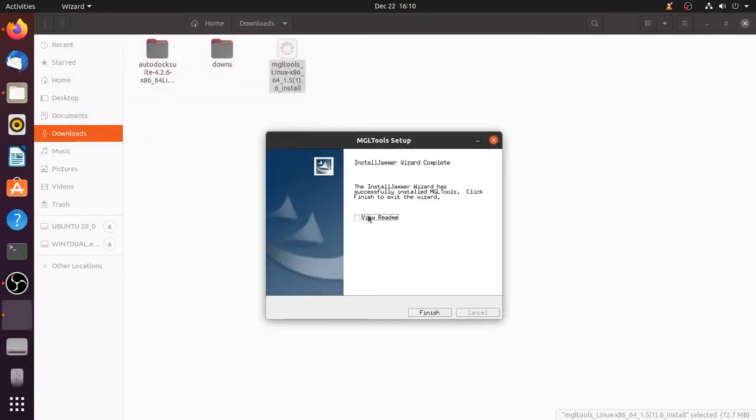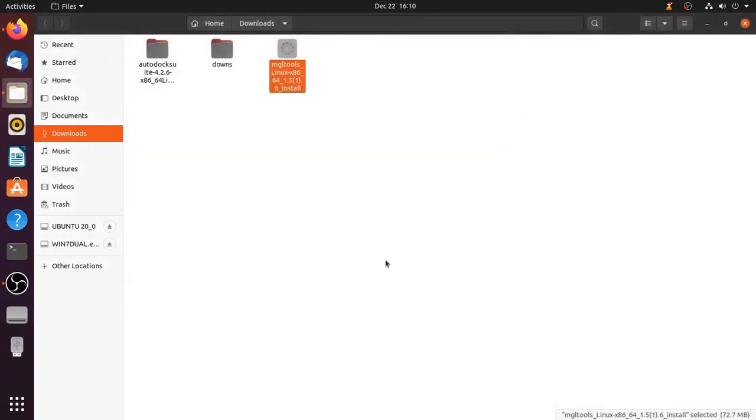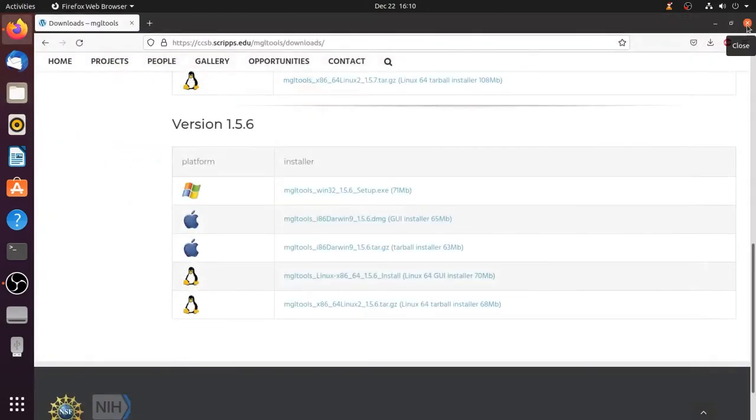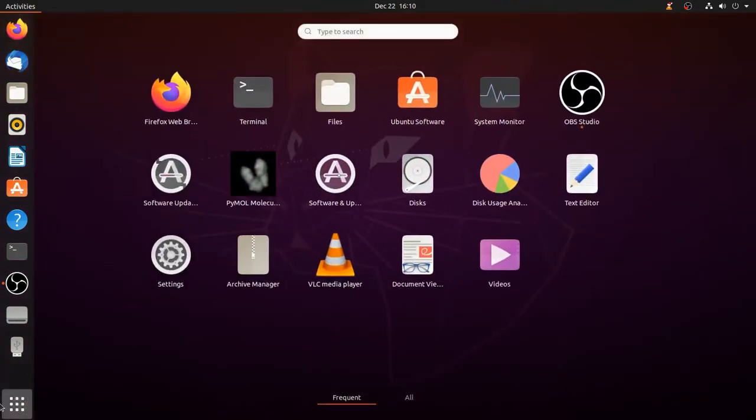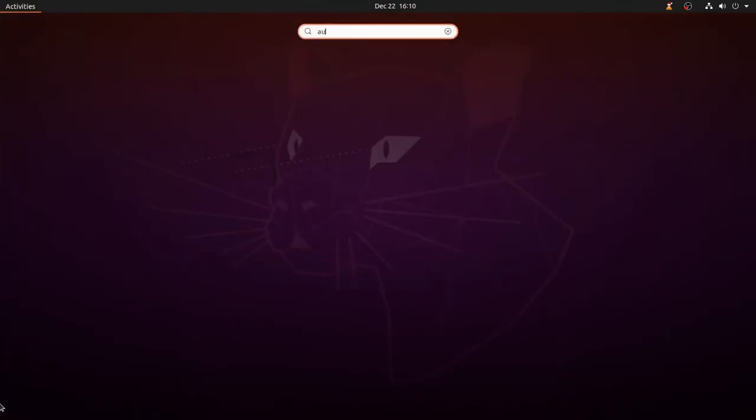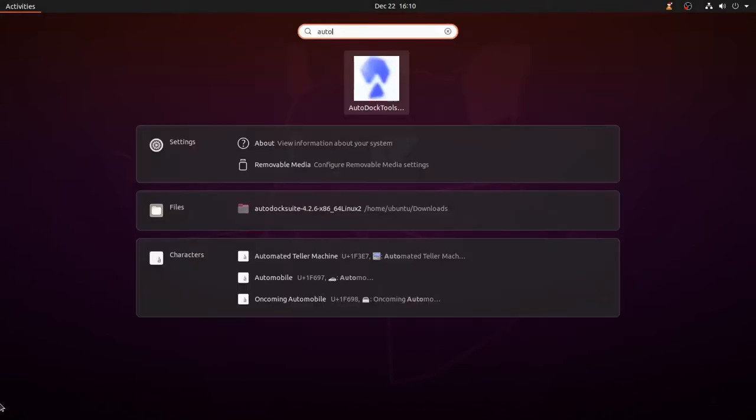That's all, MGL Tools is installed successfully. To check the installation go to start and type Autodock Tools. Now we have Autodock Tools open.